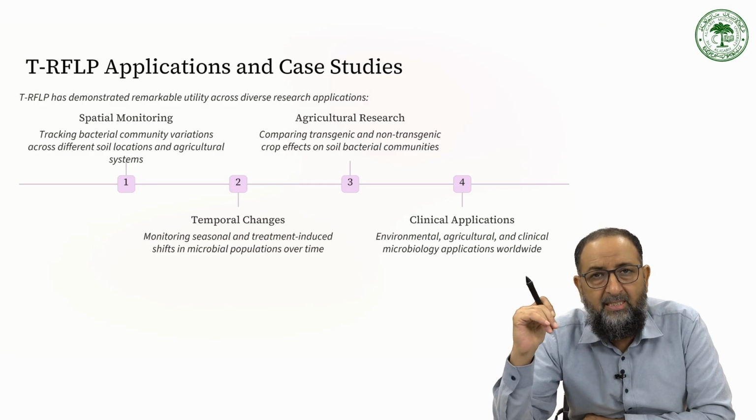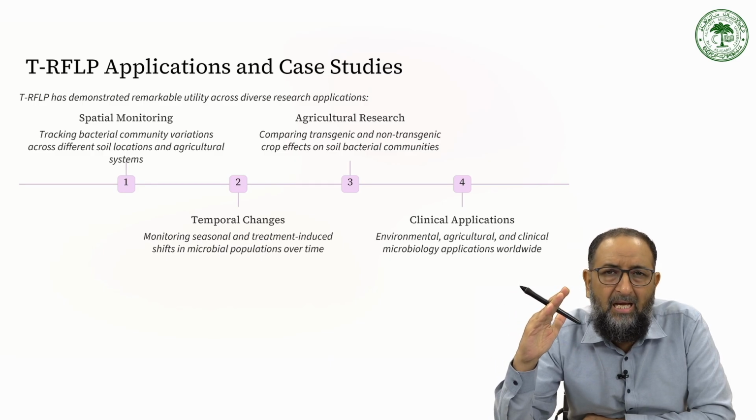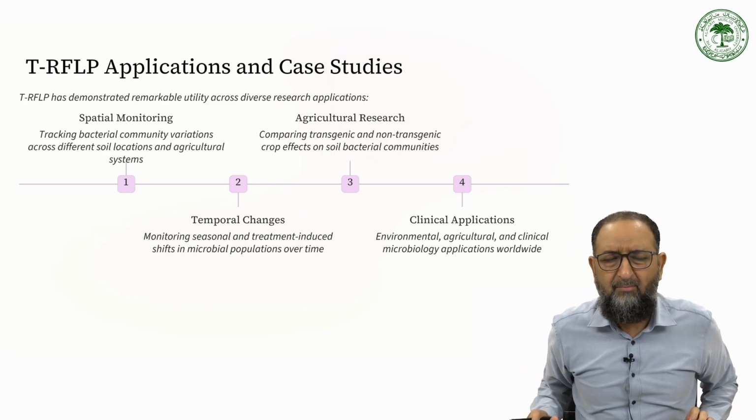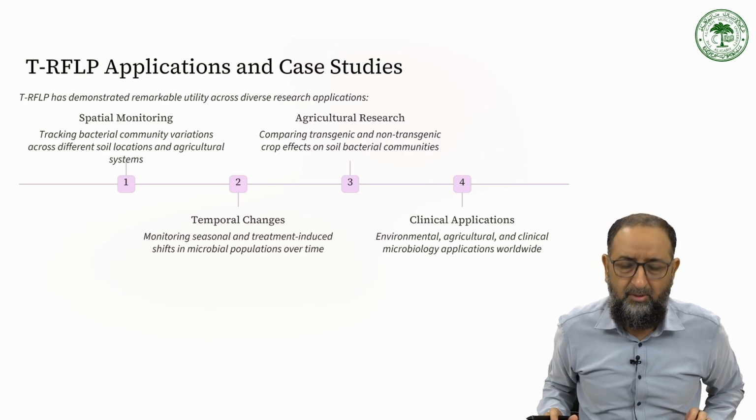environmental, agriculture, clinical microbiology application worldwide to look into the epidemic nature of these microorganisms through these techniques. That's the best method to look into the epidemiology.